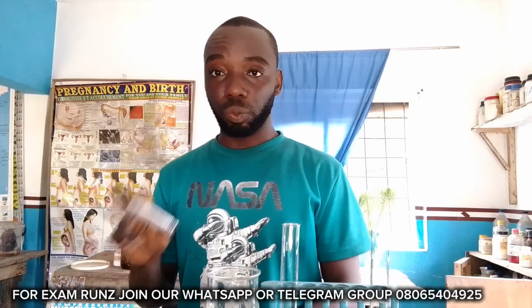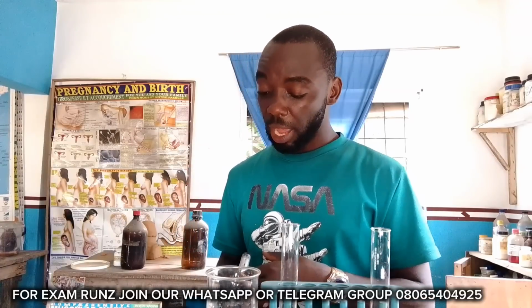Now, specimen H says test tube containing 3 ml of water. That is for the specimen provided. But if you go down to the materials that are meant to be provided by each school, you will discover that we were asked to provide sodium hydroxide and 1% copper sulphate.